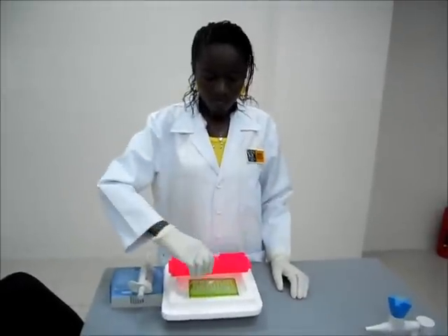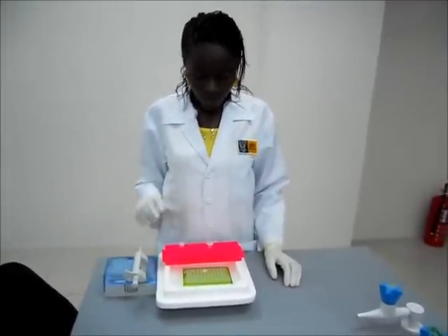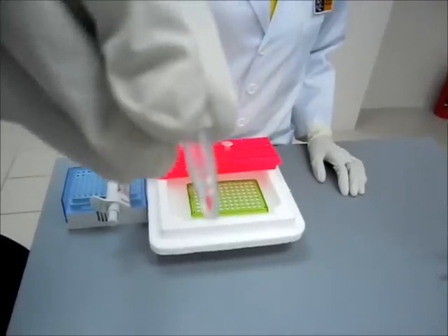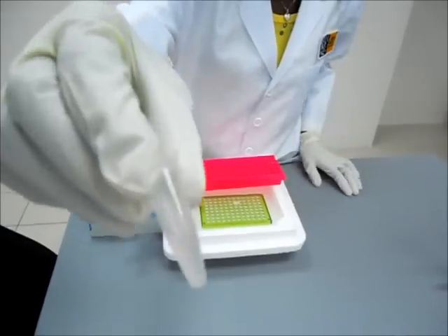So now we'll make a final mixture of the RNA sample extract and the RT-master mix. Here we have the RNA sample that was extracted and we have the RT-master mix.